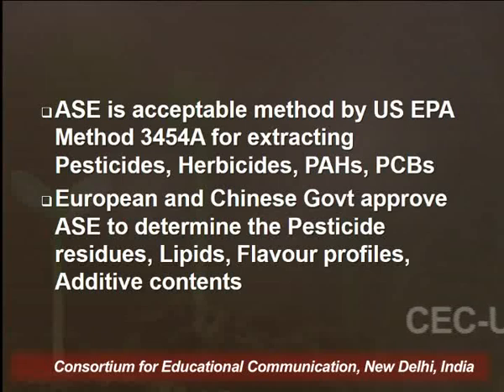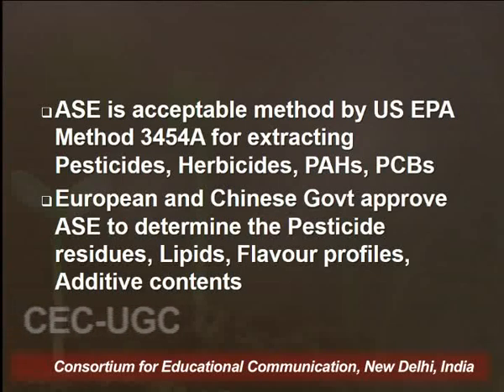So this is the importance, or the significance, of ASE, that this technique has been widely accepted by the regulatory agencies for specific purposes. In addition to that, ASE allows us to use those solvents which can be used for Soxhlet extraction, because in one of my previous lectures I told you that Soxhlet is a technique which has been widely accepted by the regulatory agencies for extracting out specific types of constituents.